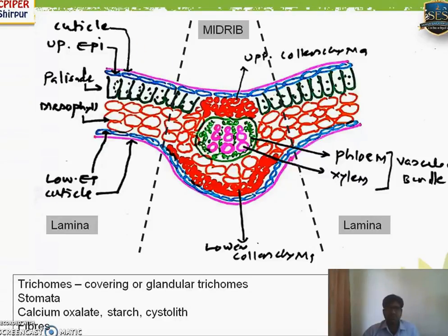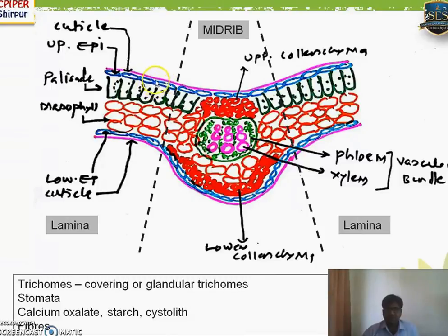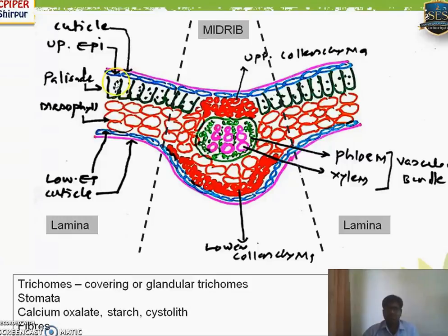In the general TS of the lamina, the cuticle is a layer present above the epidermis containing wax, which gives protection from moisture and water. The epidermis consists of tightly arranged parenchymatous cells; somewhere it shows a minute opening known as stomata, but stomata doesn't show in a TS — it is only found in surface preparation. Palisade cells are columnar cells present below the epidermis; they are green in color because they contain chloroplasts.